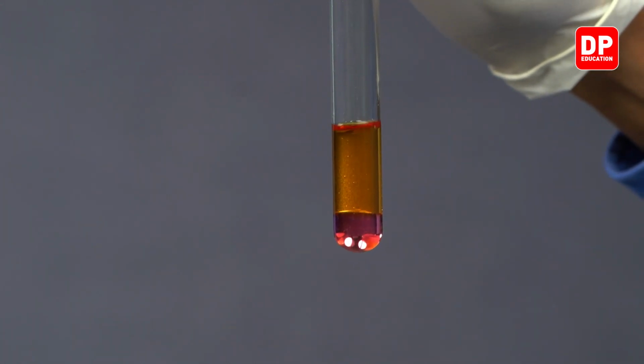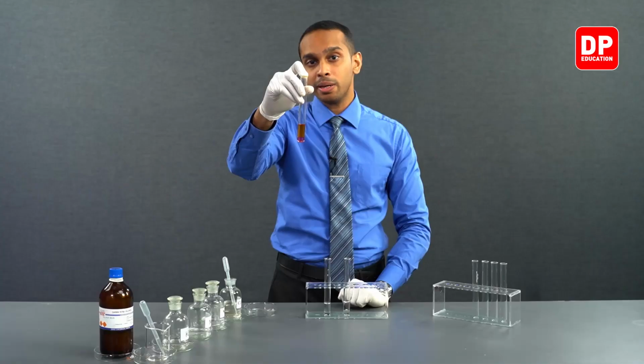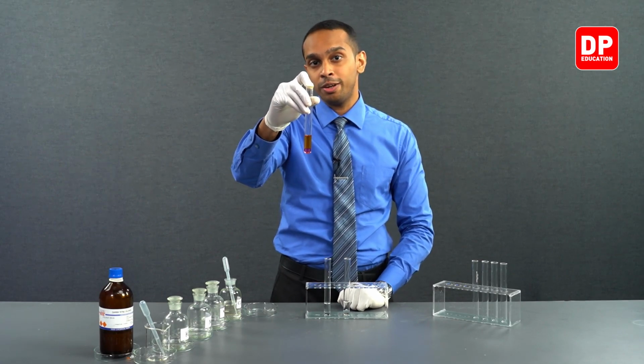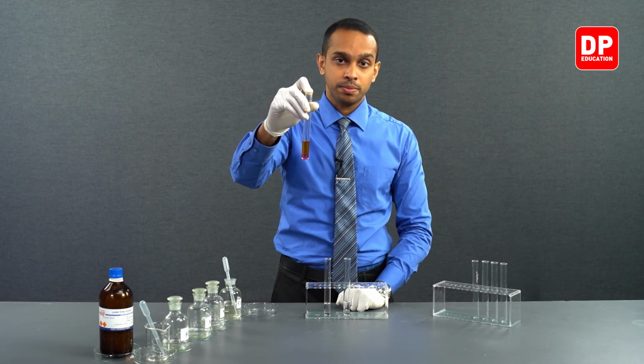So the observation over here is the presence of a purple color in the CCl4 layer, which is evidence of I2 being formed upon addition of chlorine water.